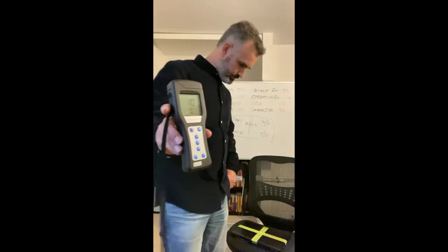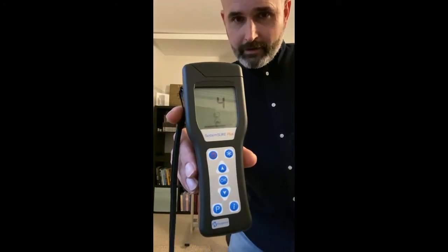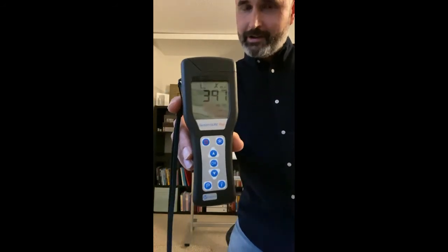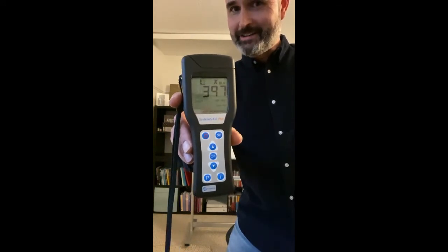Okay, so we're doing the countdown here. And this is for the sanitize only section. So let's see what we get here. That's a terrible number. Wow. Okay, 397. So that's actually higher than when we started.